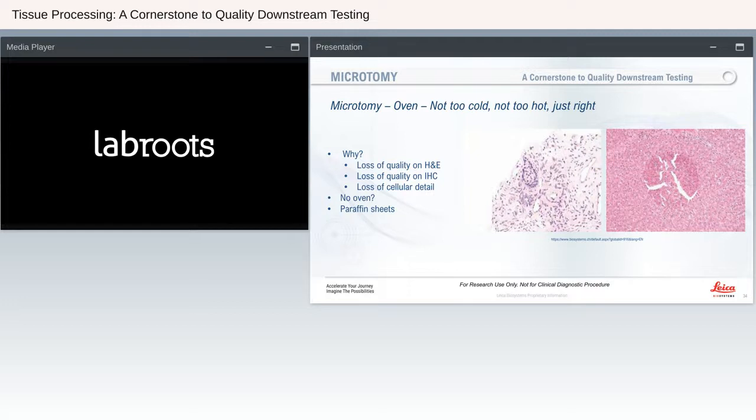There has been literature out there that talks about sectioning tissue for IHC not too far in advance, as if the sections are taken and not stored properly, even in clinical settings, they used to do it where it would sit at room temperature for a few days until they did it.